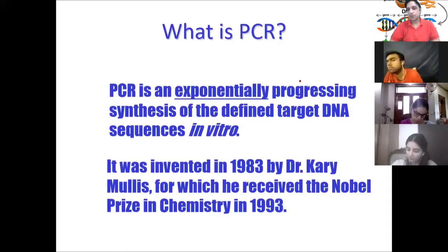The other difference. Why are Taq polymerases used? Why do we not use human polymerases?